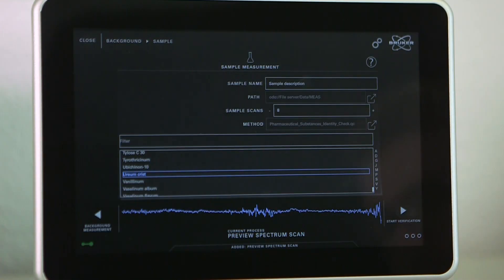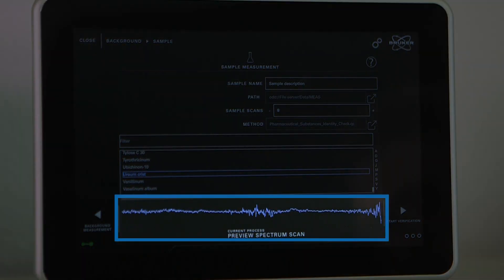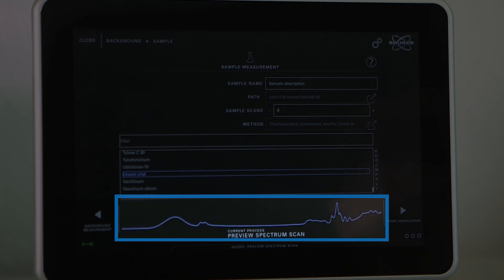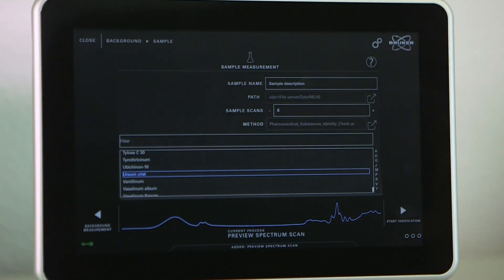The preview spectrum indicates the quality of contact between the diamond and sample. It should already display the sample spectral fingerprint well above the baseline.